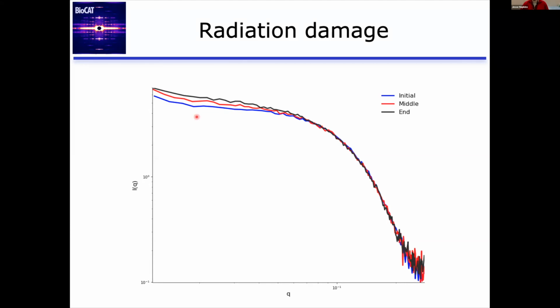So this is another way of seeing that same kind of damage, but manifesting not from poor sample prep, or maybe not poor sample prep, but just samples that aren't behaving as you expect, but manifesting from the beam itself, from the probe that we're using to study the sample.